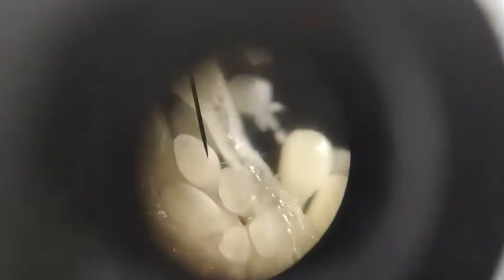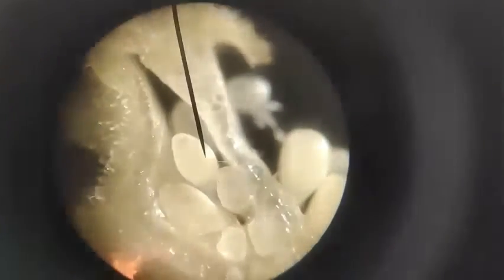They should be fertilized now. Look at them. This is inside the ovary. I just cut a very small, thin layer of this section of the ovary. And look at the egg. It's not an egg yet. It looks like an egg, but we call it a seed later. There are ovules that look like they are being fertilized. So beautiful, so mysterious.